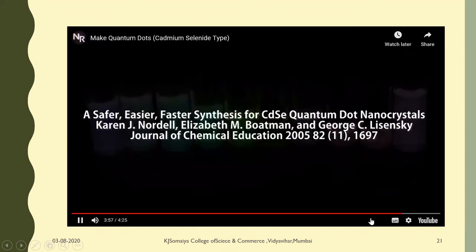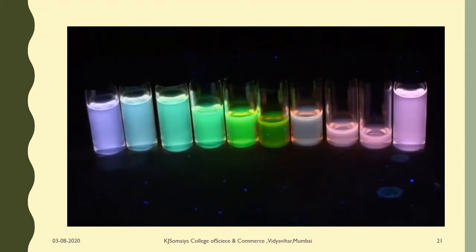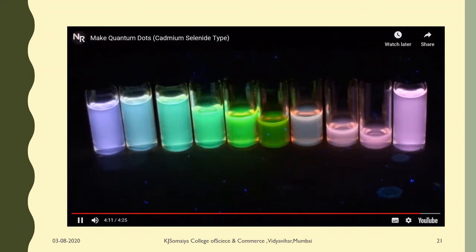Now an additional experimental note if you try this is that you probably won't actually see this broad range of color with your eyes, since the wavelength differences are actually very subtle. You'll probably only see yellow and green. That's all I'm actually seeing here in real life. But a good high definition camera will automatically color compensate to give the appearance of this broad range you're seeing in the video. So to observe these differences, if you don't have a fluorescent spectrometer, look at the samples through a good digital camera.